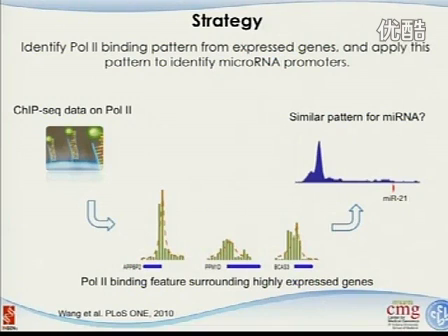The reason for that is for these protein coding genes, we know, at least we think we know, where the gene starts, so where the transcription starting site is and where the promoter region is located. For these genes, we can really look for the RNA polymerase II binding patterns around this region and try to find out if there are any common features of the binding patterns.